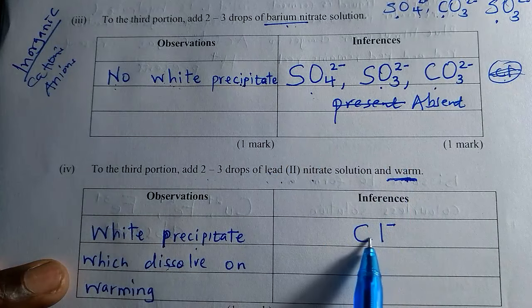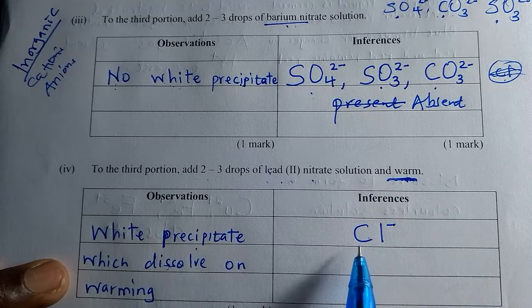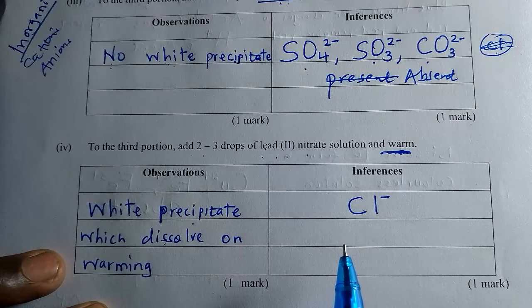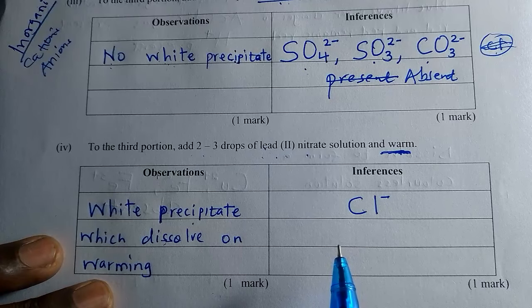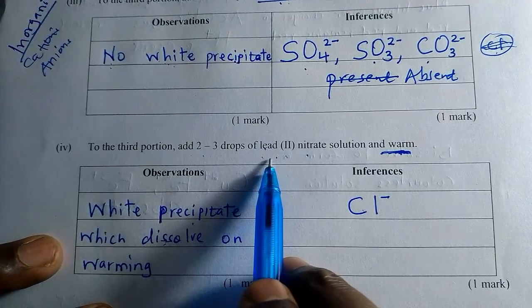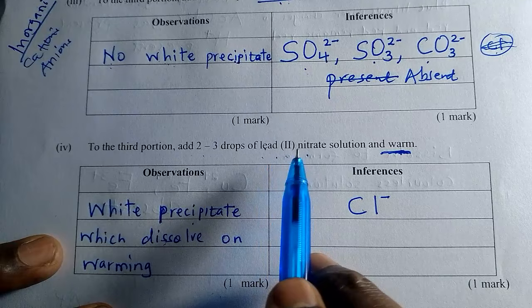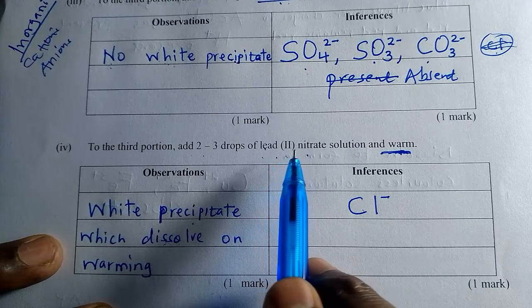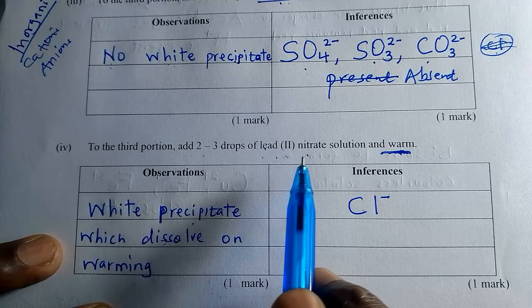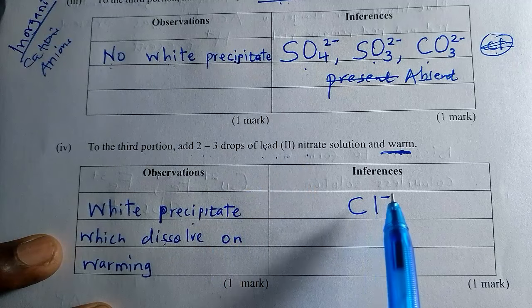But this one, when you warm, the white precipitate dissolves. That's why we say in Form 2 that all chlorides are soluble except lead chloride and silver chloride. Then we give you a note that lead 2 chloride is soluble when warmed. On warming, it dissolves to form a colorless solution. So it means that this one is present.